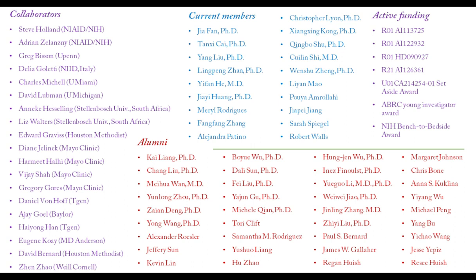Okay, it looks like we have time for one more question. What is the commercialization plan for the assay? That's a good question. We already have a company established in Phoenix in 2018, and at the end of last year we also received state funding and investment. Right now we're working on different milestones, and the company is preparing the Q submission and will set up the connection with the FDA for approval of this assay.